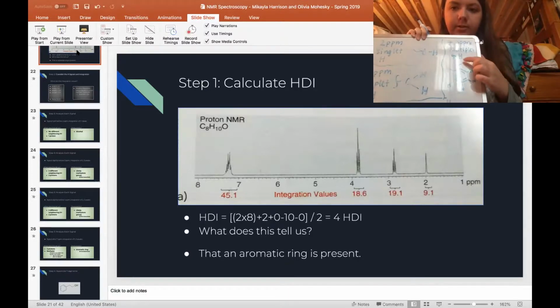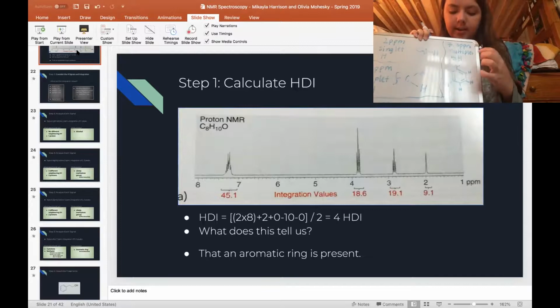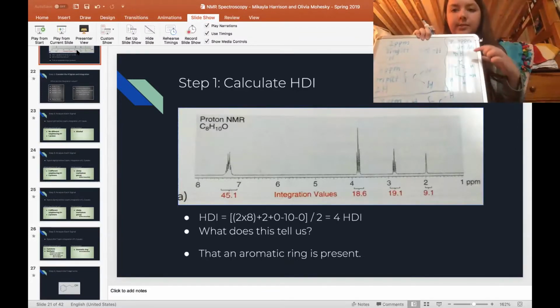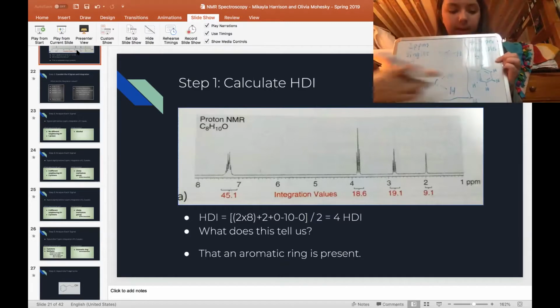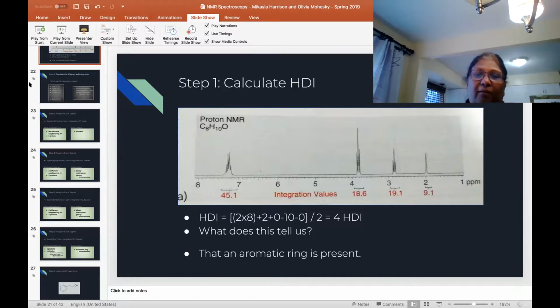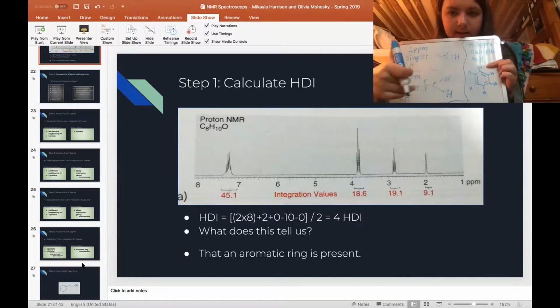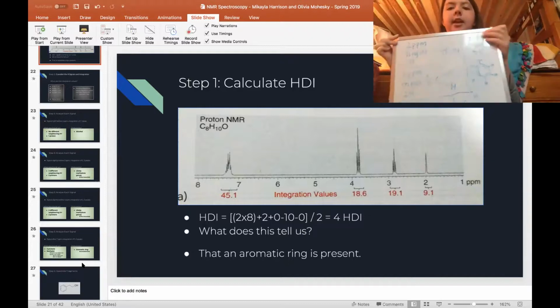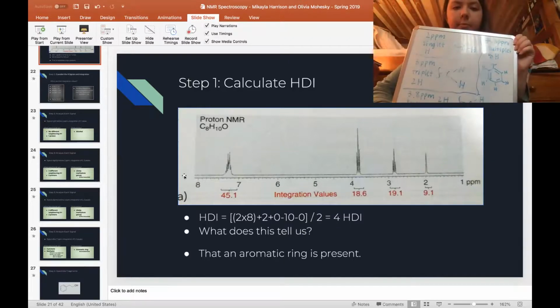This is important because you know that there's only one area. If there were 4 hydrogens, then you'd know that there are 2 regions that need to be added on, but because it was 5, we know it's going to be like this, with something else connected. So it's a mono-substituted ring. And if you have 4 hydrogens, then it's likely to be a di-substituted ring. So then the next thing to do is pair all these together and see if they match up with the structure and the values you're getting on this graph.